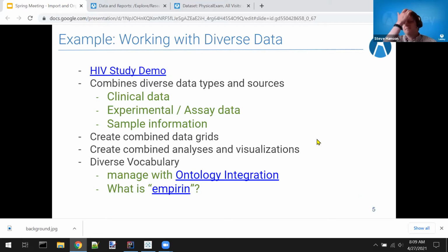So sample types will have the ability in our next release, 21.7, to essentially copy to study, or really we call it link to study from a sample type, so that samples that are participating in a particular clinical trial can be linked to that trial with essentially a sample data set in the same manner. So we're using that same model for sample types.